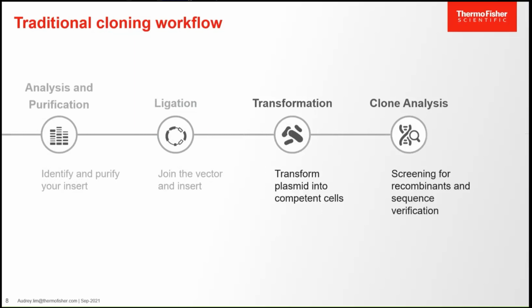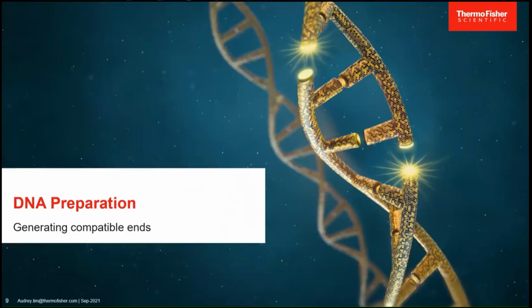And finally, screening and sequence verification will be performed to identify the bacterial cells, whether they have taken up the recombinant plasmid with your desired sequence or not. Okay, so this is the whole workflow for traditional molecular cloning.